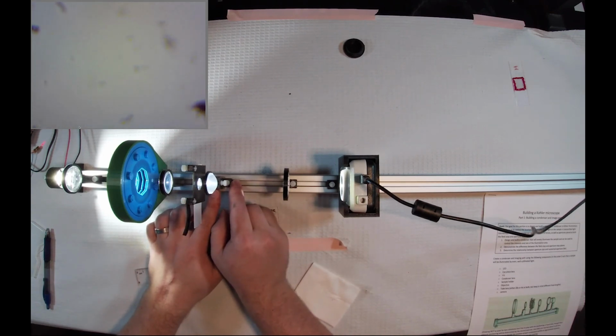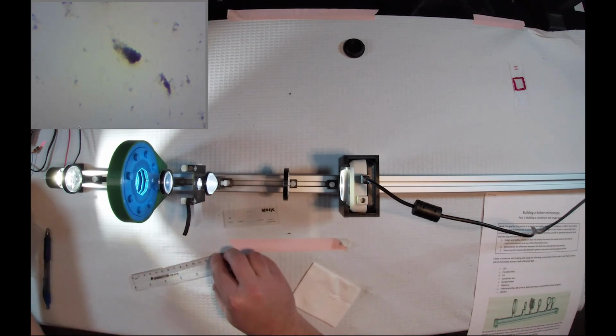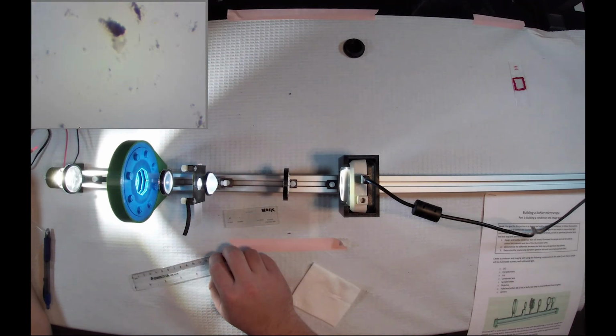Pond samples are typically pretty good because you have lots of things that have chlorophyll in them. Chlorophyll, as you know, is very green. It absorbs pretty much everything that's not green light, so it acts as a color filter effectively. And you can even see with some of the scum, there's probably a bit of a green tinge to it. And even if I jack up the intensity of my illumination light, things get a little bit washed out, but still are quite a bit darker than the background.